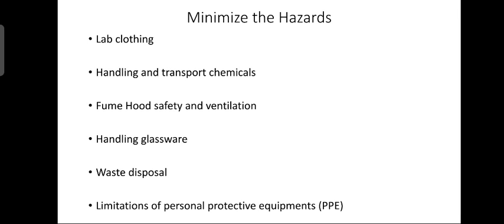Now let us see what is lab clothing. Clothing worn in the laboratory should offer protection from splashes and spills, and it should be easily removable in case of an accident.